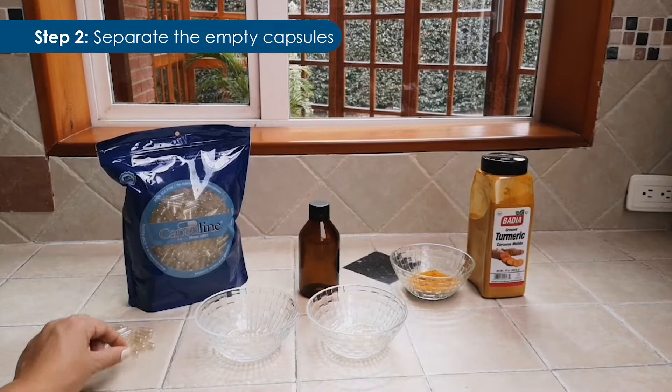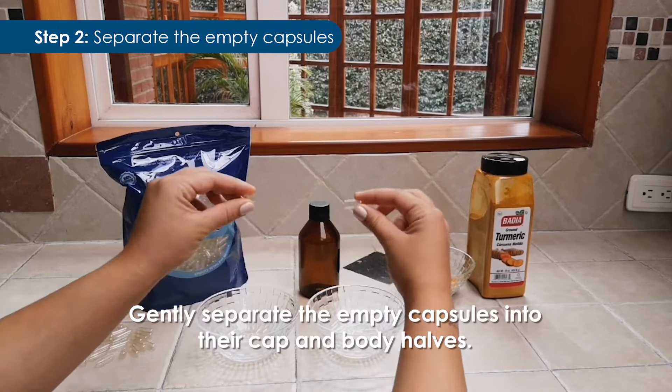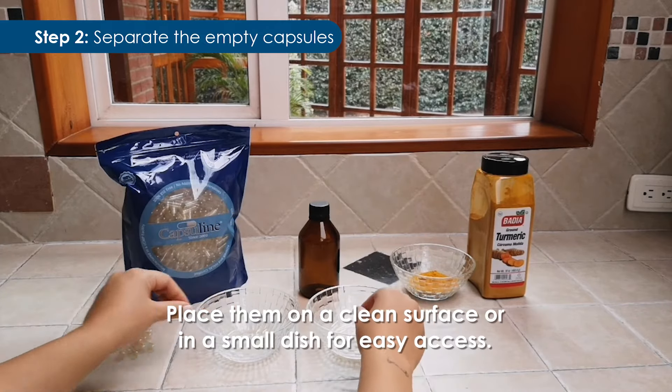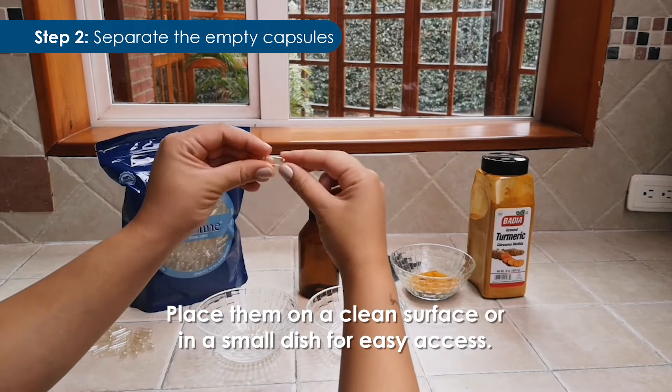Step 2: Separate the empty capsules. Gently separate the empty capsules into their cap and body halves. Place them on a clean surface or in a small dish for easy access.